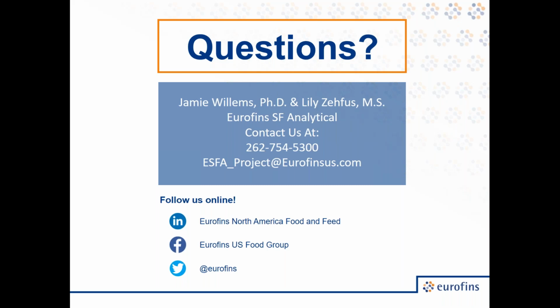Right, and I think just, Josh, to add to that, really, companies before they use these bottles do extensive leaching studies. So if there was a particular complaint, we certainly could, but haven't had any specific investigations in that regard.